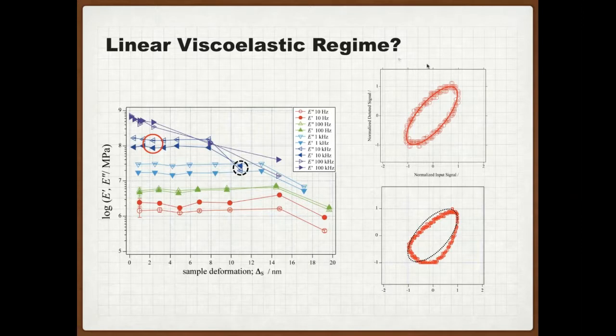Yeah. And one further question, maybe also interesting for both presenters. What kind of spatial resolution do you think you can achieve with this technique? So the highest resolution I have done is probably that block copolymer data I showed earlier, where the resolution was around 20 nanometers. However, we have not done any measurements with sharp tips. Basically, the probes we're using are 30 nanometer or bigger tip radius. So it doesn't seem like we've really tried to push it to really very high resolution.